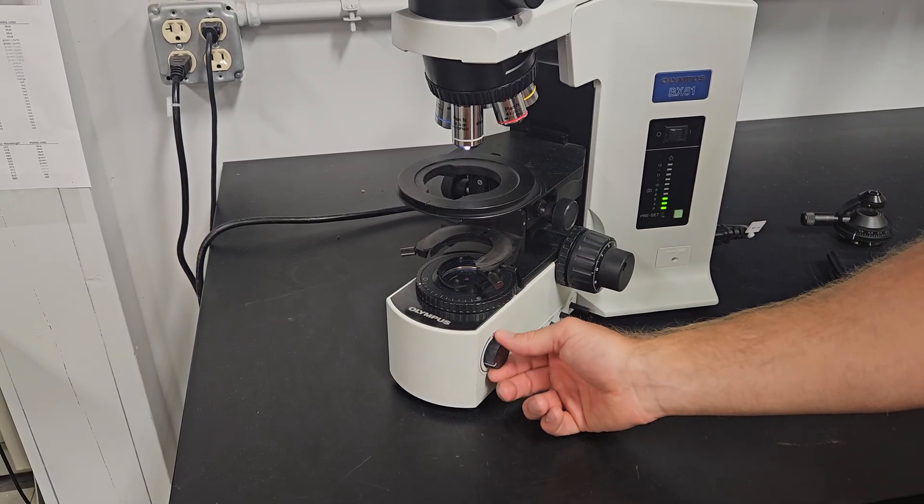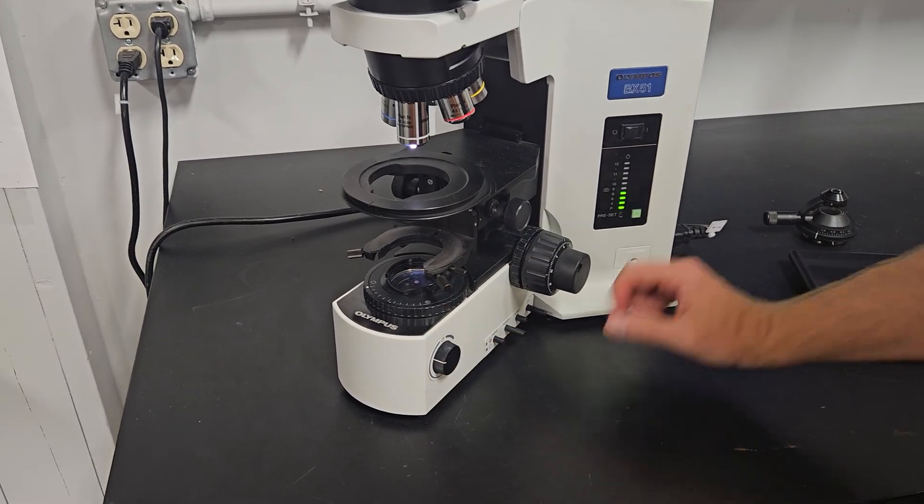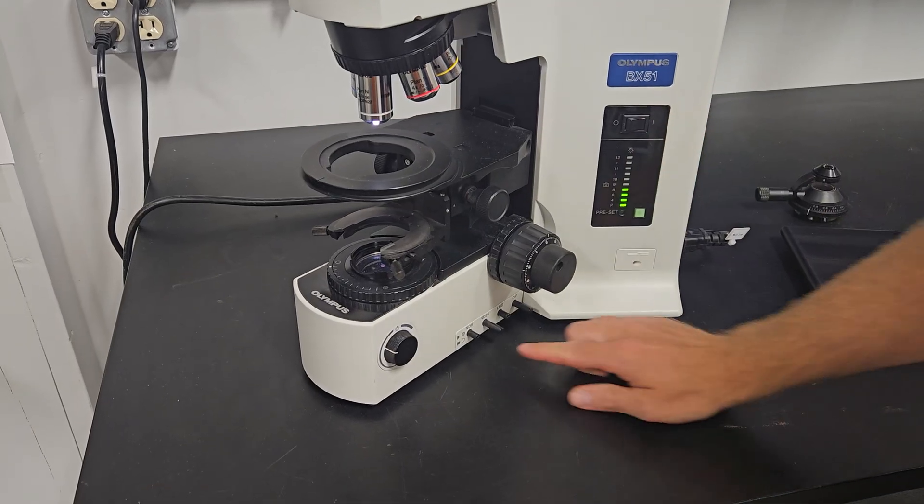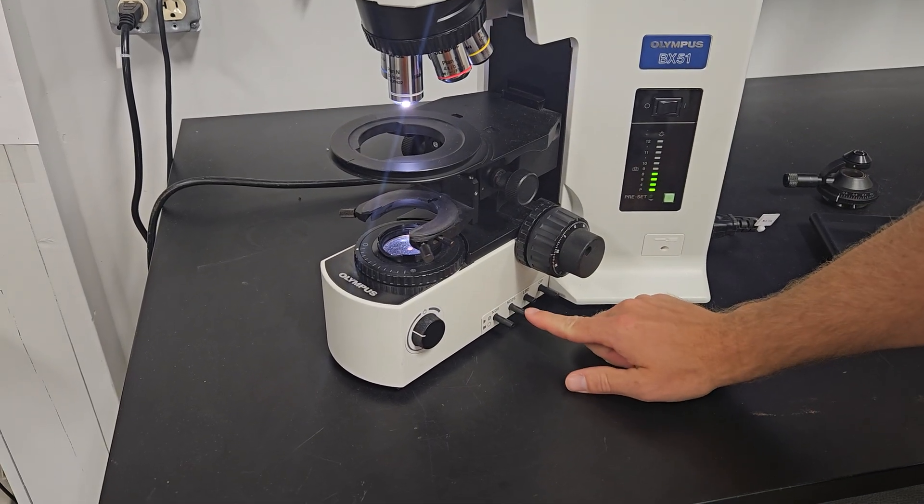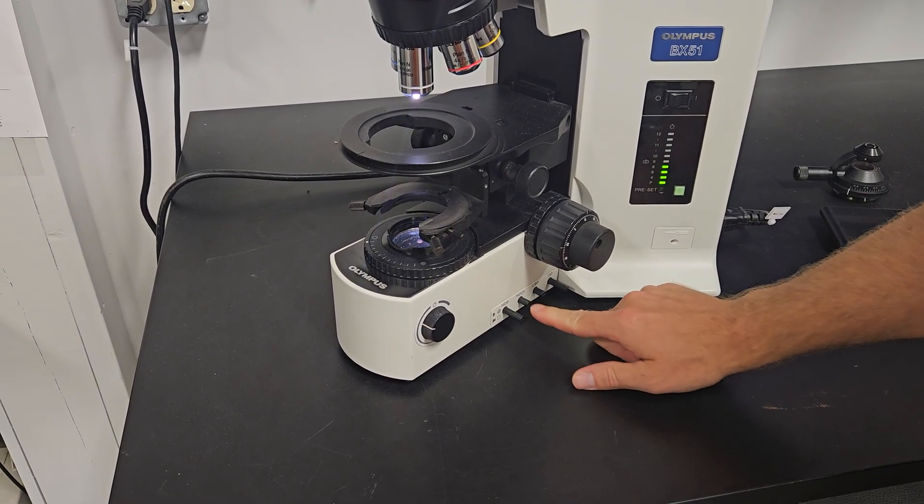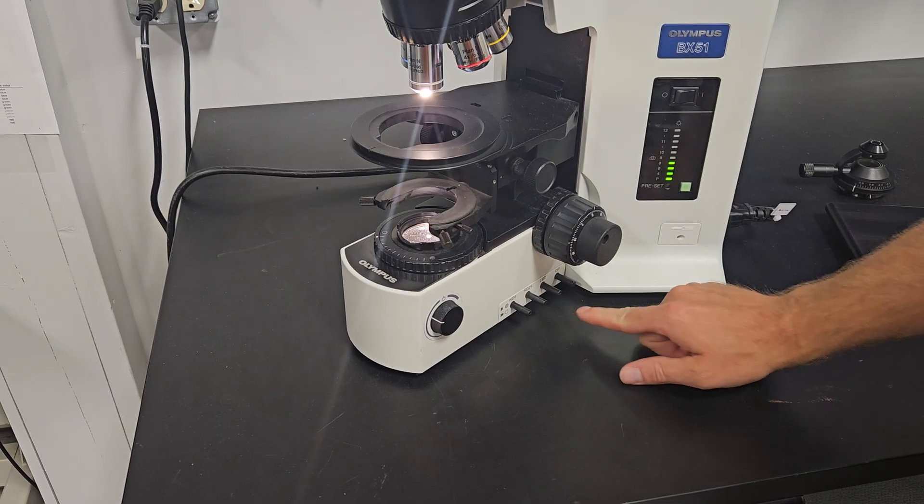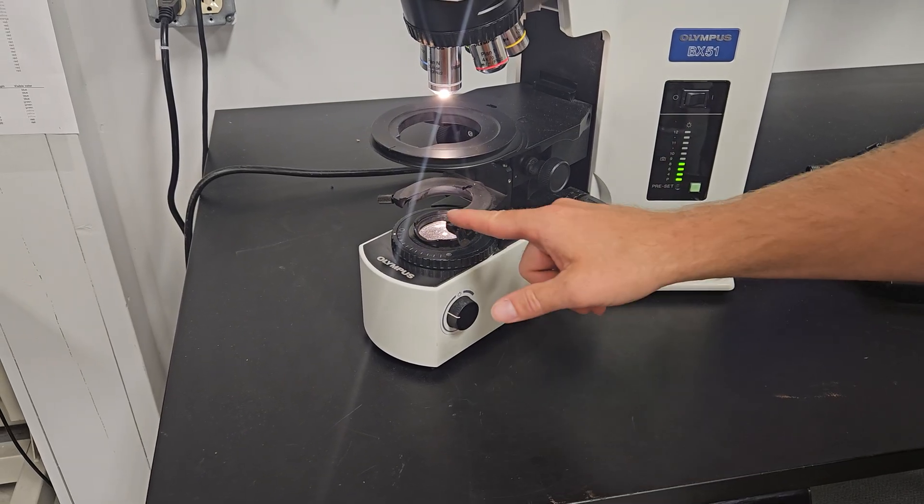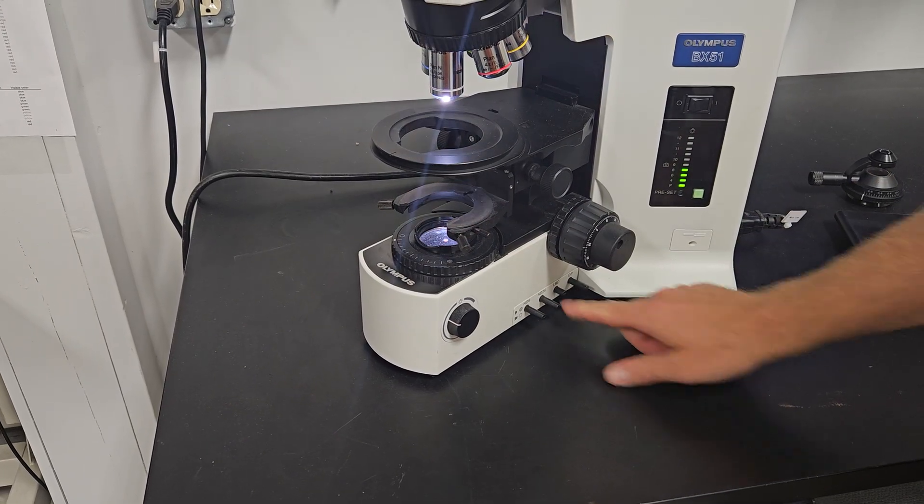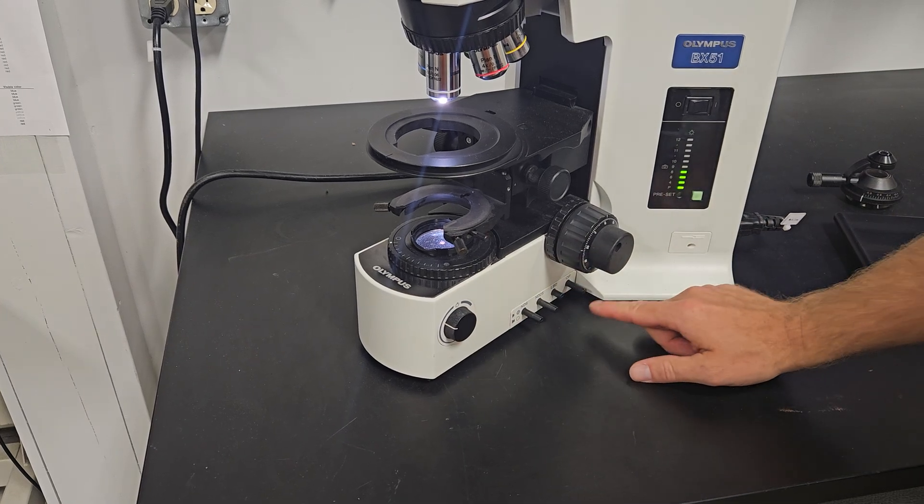You have your rheostat right here. These filters, we get a lot of questions on 51s about these filters. There's a neutral density filter here, neutral density filter here, daylight blue filter. See when we click that one out, the light's kind of yellow looking. So you want that, that'll give you a crisp white, nice looking light.